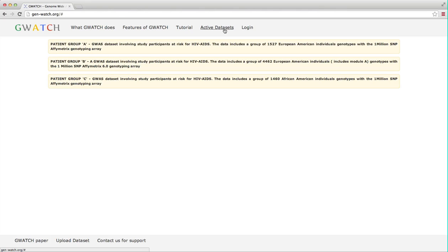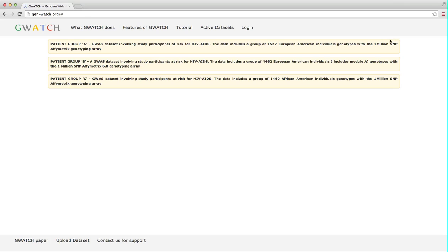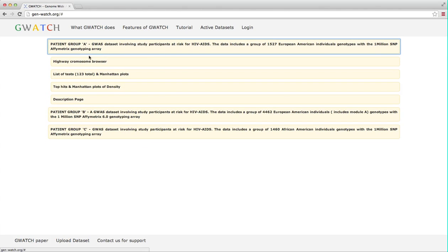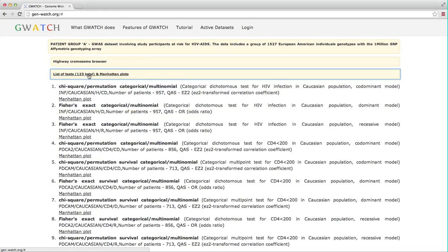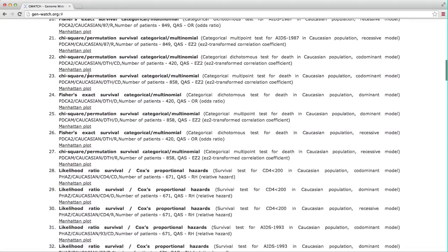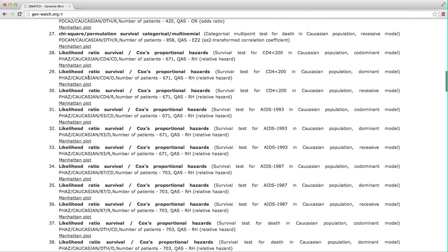This page lists three big GWAS datasets labeled A, B and C which are currently available in GWATCH. The first, Module A, genotypes 1,527 people at risk for AIDS using the Affymetrix 1,000,000 SNP genotyping array. 123 different association tests were run. If we click list of tests section, we will see a group of tests described and linked to an instant Manhattan plot for any single test.